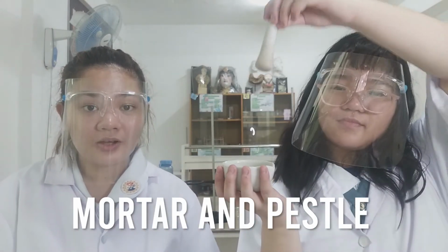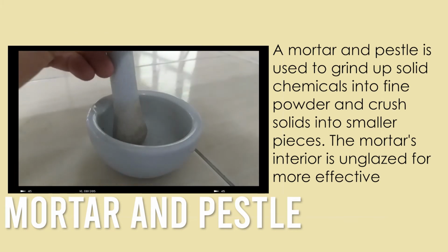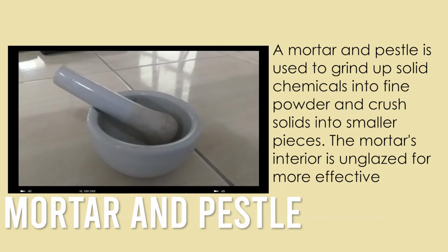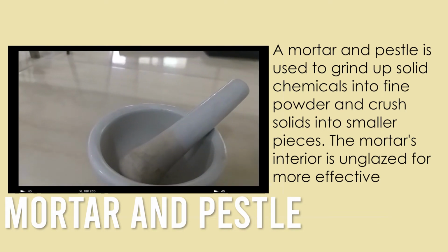To continue, we have the mortar and pestle. It is often used to prepare reactants for solid-state synthesis. It is also used to grind up solid chemicals into fine powder and crush solids into smaller pieces.